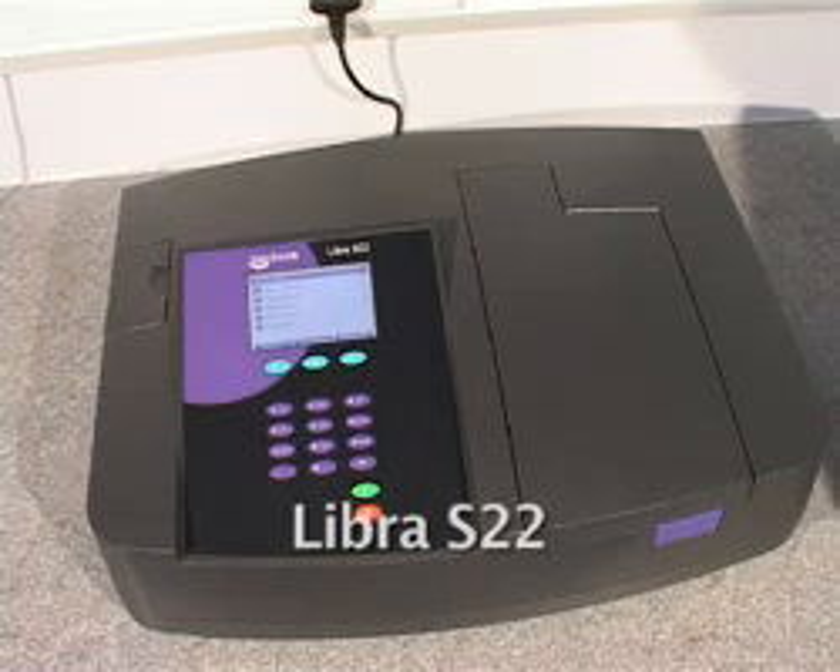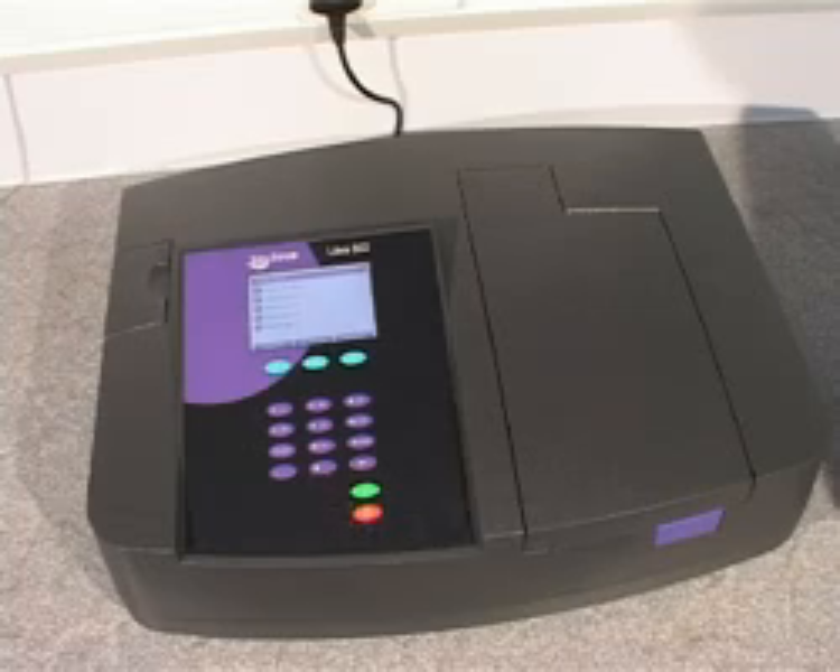The Libra S22 is a UV visible spectrophotometer manufactured by Biochrom in Cambridge. With a built-in graphical display, comprehensive software, and a range of sample handling accessories, it offers flexible performance for any laboratory.